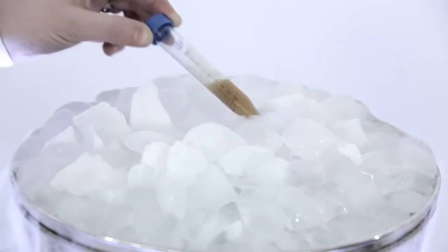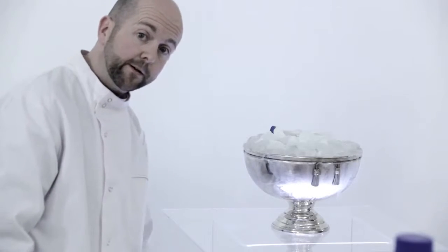I keep the sample on ice to maintain protein integrity. If the sample has been frozen or stored for a long time, I give it an extra sonication to minimize the viscosity. Check the link to the protocol diagram.